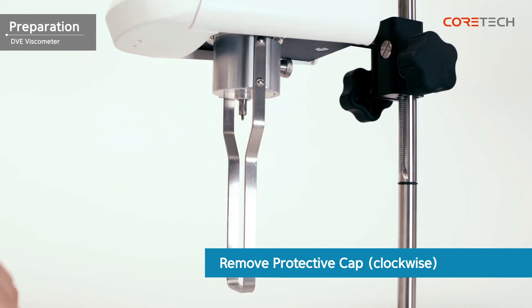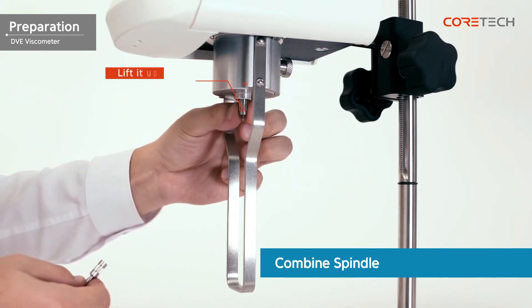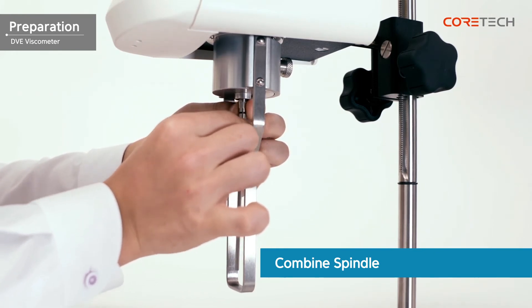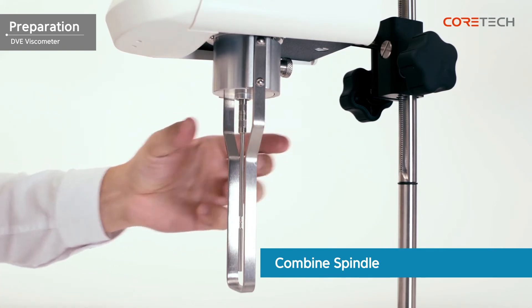First, turn the protective cap counter-clockwise to remove it. The coupling screw must be slightly raised upwards. With the coupling screw slightly raised, rotate the spindle clockwise to install it. If you turn it too hard, the pivot may be damaged, so be careful.